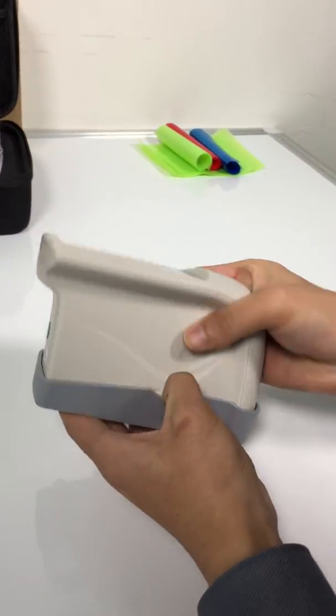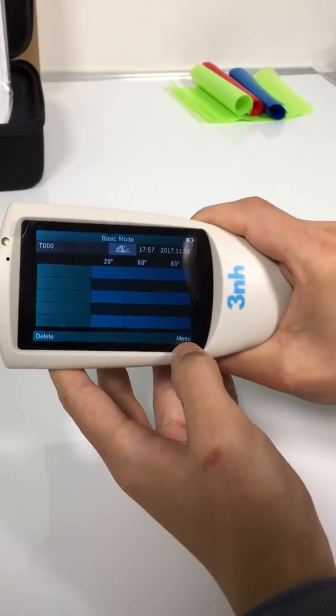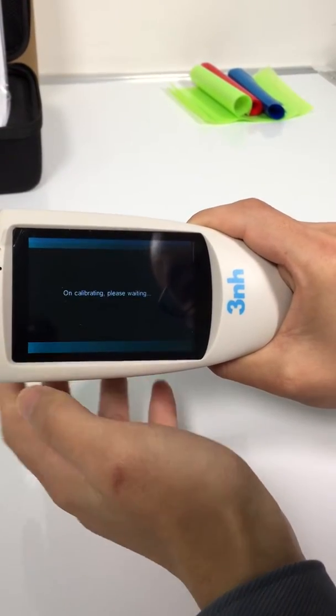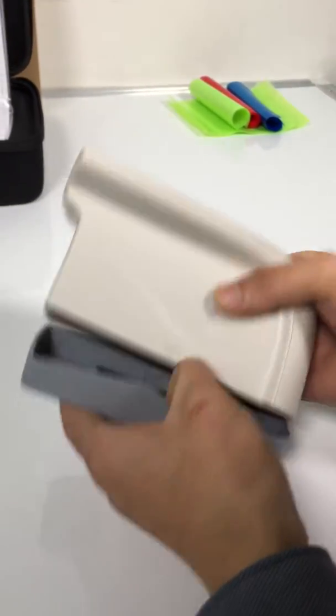First, we do calibration. Calibration finished. It's ready for measuring.